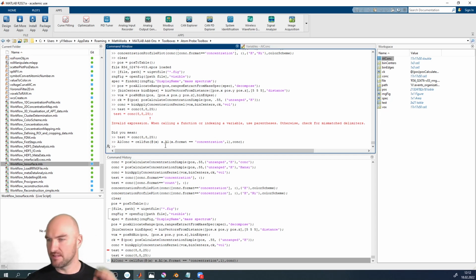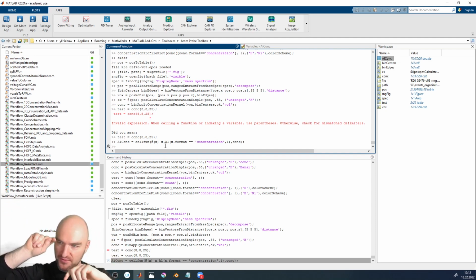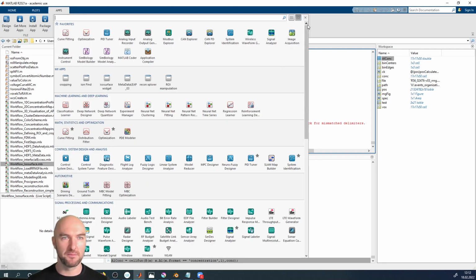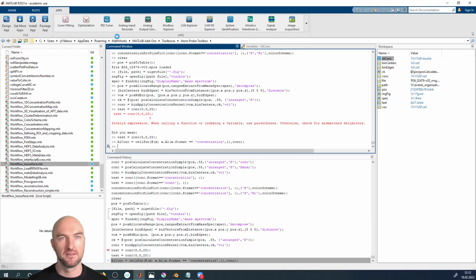And again, in this case, it doesn't matter how you chopped up your data set. You could chop it up by any means, distance, counts, whatever. I'm pretty sure you people are creative out there. And I can actually look at that in 3D. MATLAB has a volume viewer. I showed that to you yesterday already.